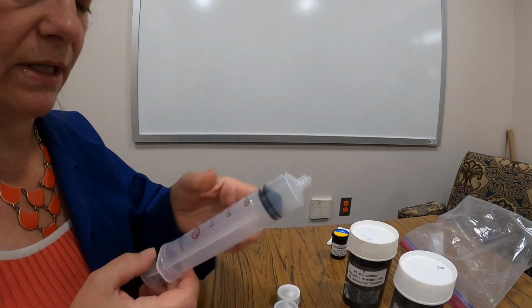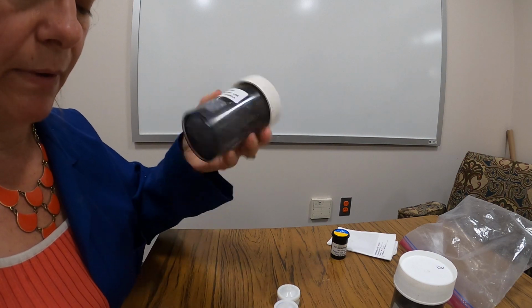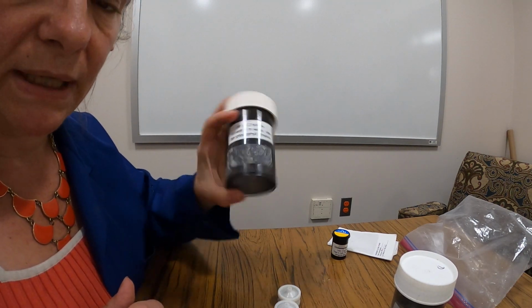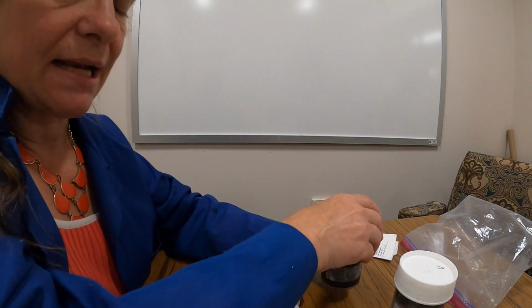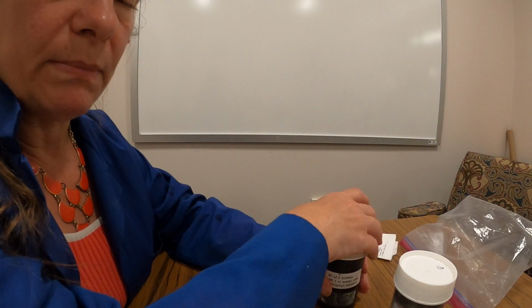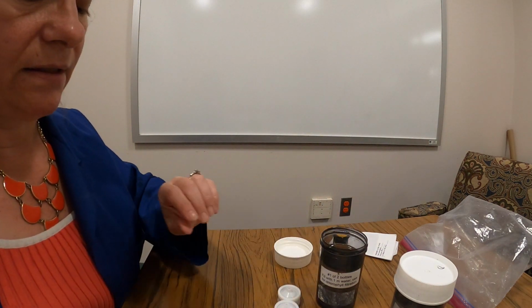I'm going to take my syringe. I'm going to mix up a little bit of my sample, and we want to make sure that when we're working with water samples, we keep them well mixed, especially when we're measuring chlorophyll, because algae settles at different rates, so we want to have as well mixed a sample as we can. So I'm going to take the lid off.